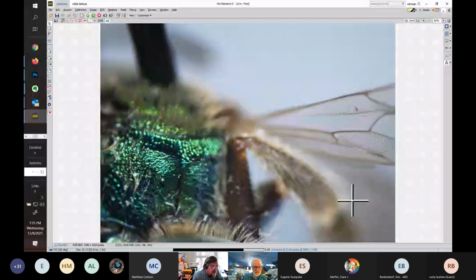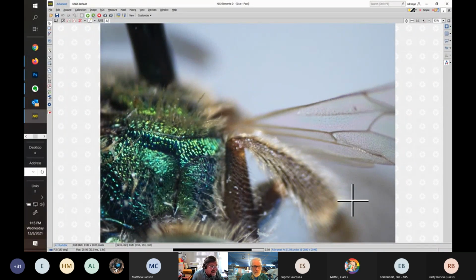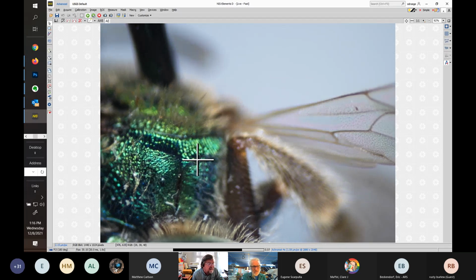I'm not sure what I'm seeing now. Let's see. So here's the dorsal triangles and the striations still, and here we have T1 of the abdomen, and this is about the best peek I can get. Okay. So some of it's in focus, some of it's not, of the rear face. Yep. And that looks wrinkled and sculptured to some extent to me, but it's hard to see exactly.